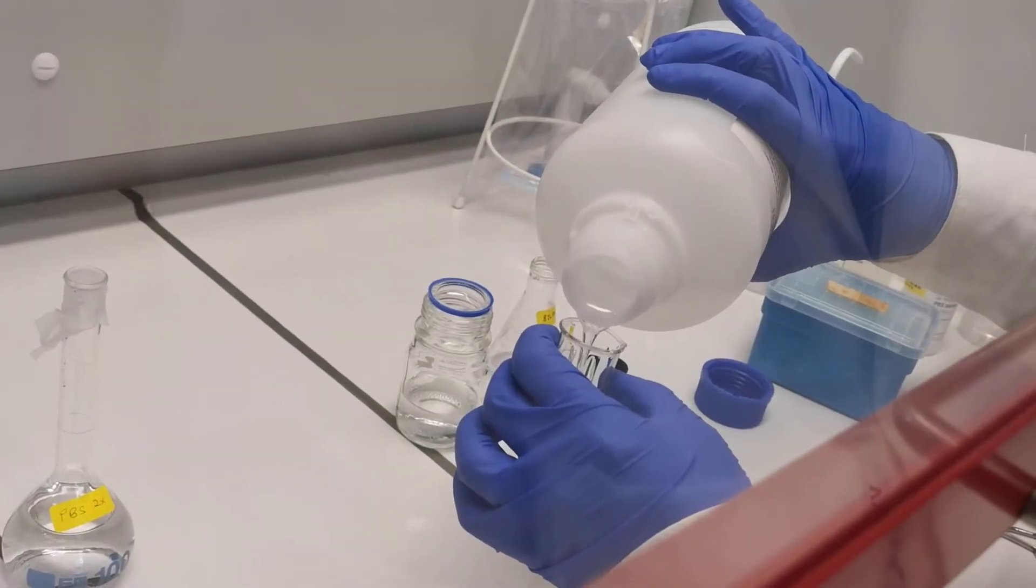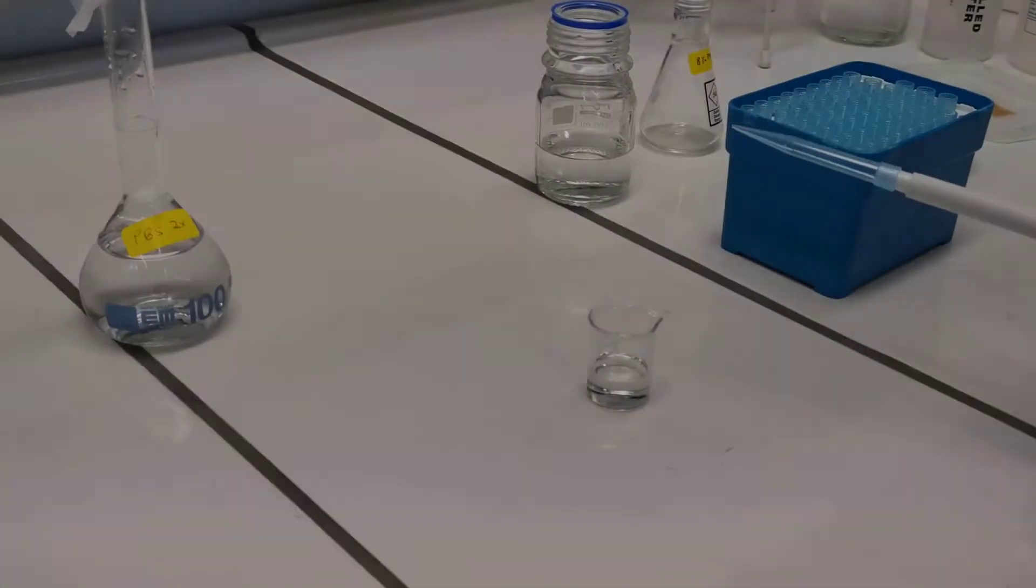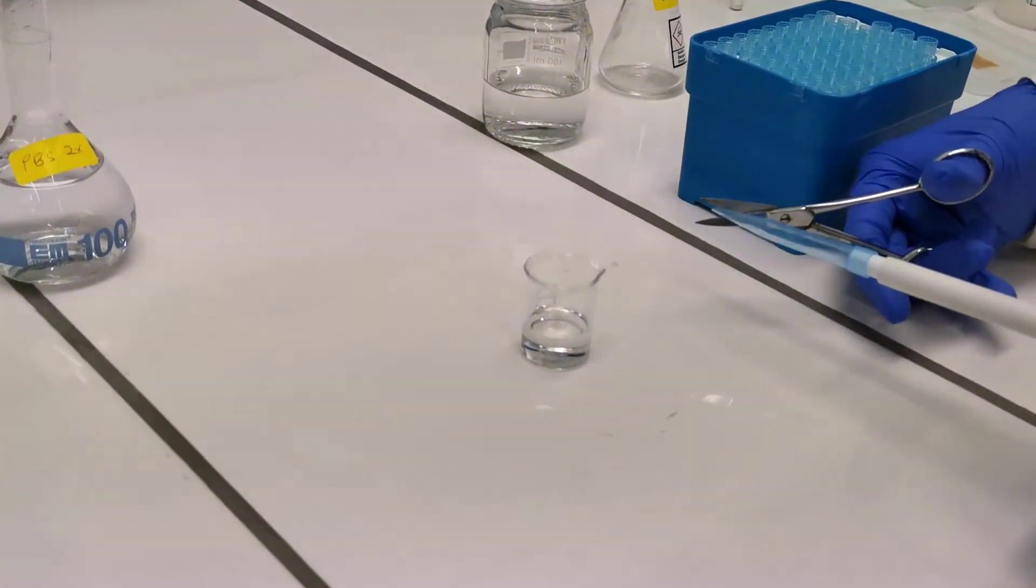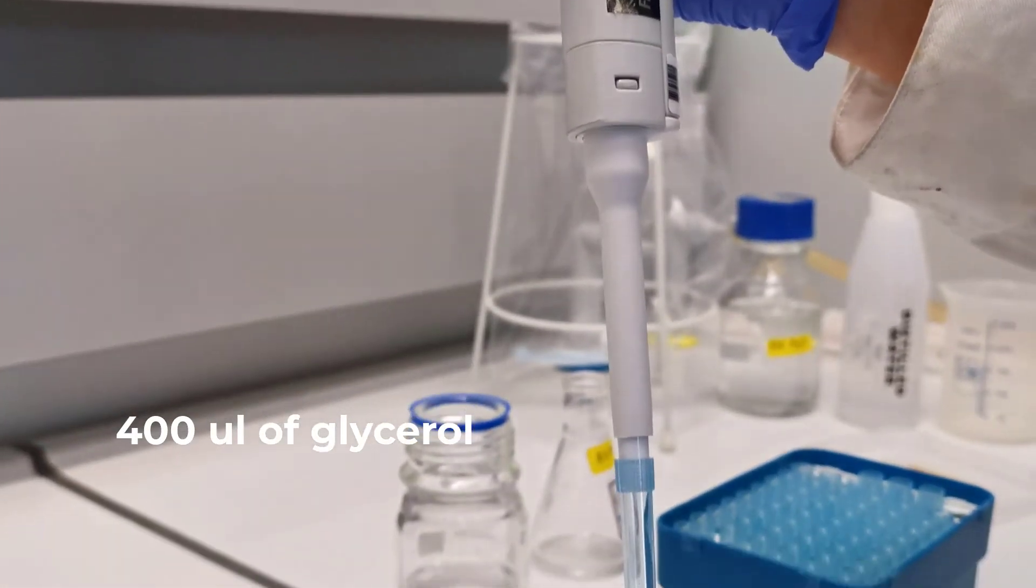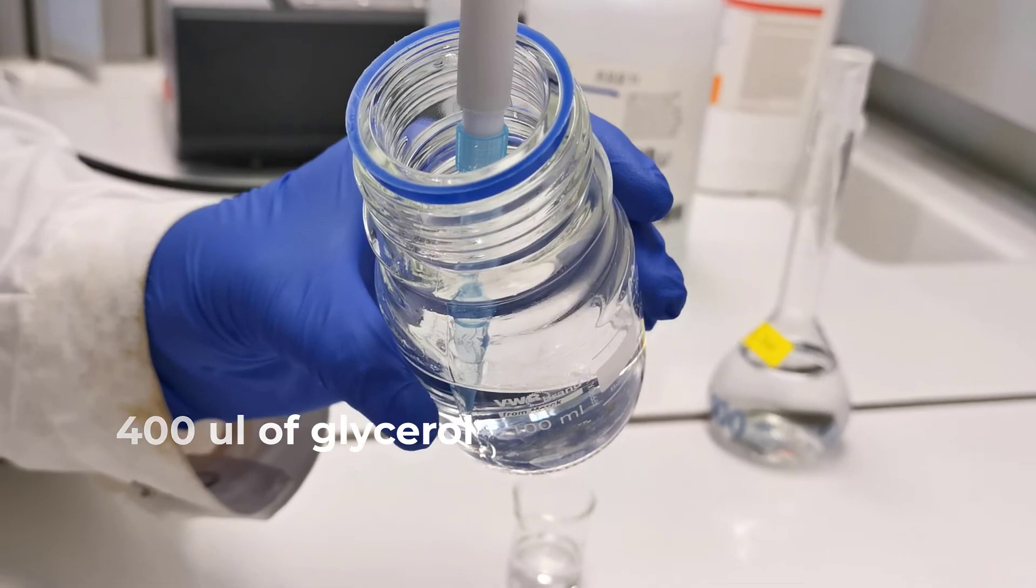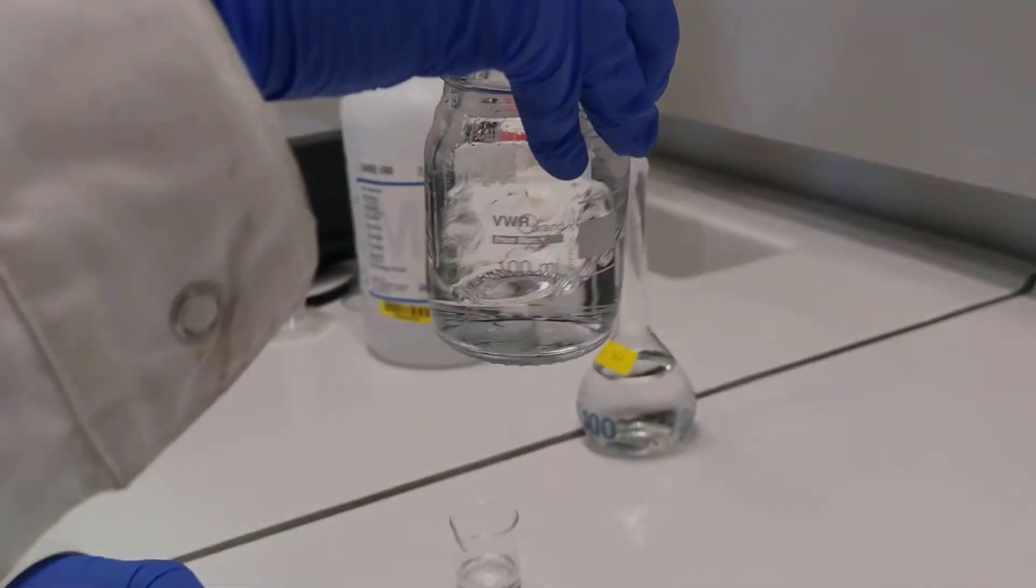We also add glycerol to our fixative at a rate of 1% of the total volume of the fixative. Glycerol is added to enhance the color of the fixed specimen for long-term storage. So in our case, 400 microliter of glycerol is added to our fixative.